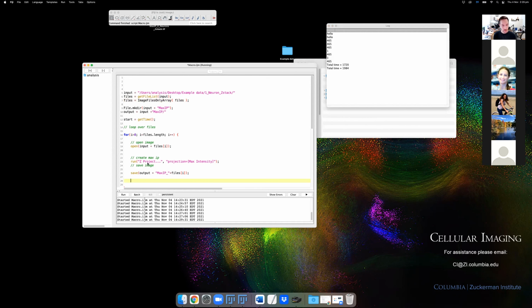So to close images, there's a few useful things here. You can close and you can type in a specific name of a window that's open if you just want to close something specifically. A useful one is close others. This will just keep the image that you have open and close everything else. And this is really useful if you're processing big data sets, but you're focusing in on one image that you wanted to treat out of that data set.